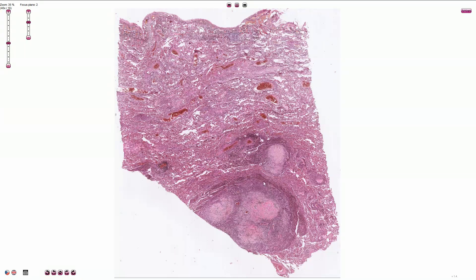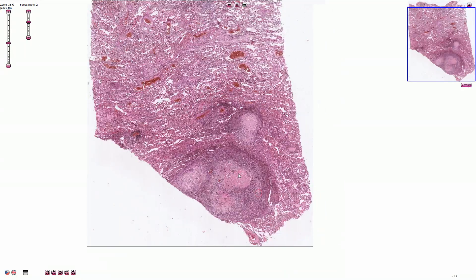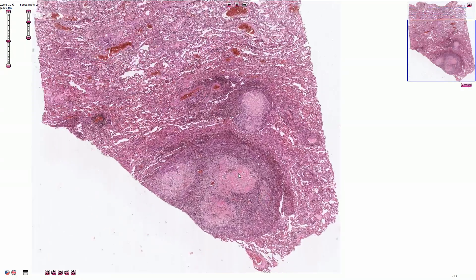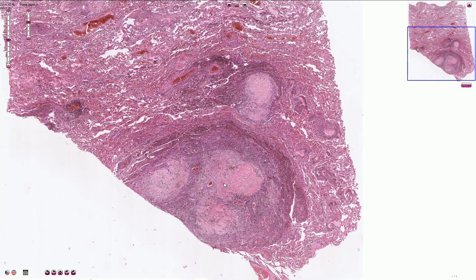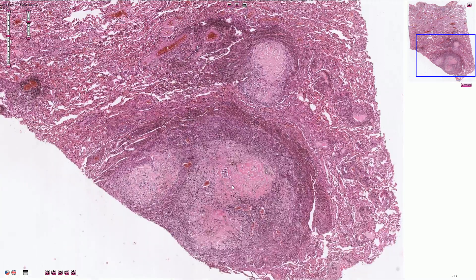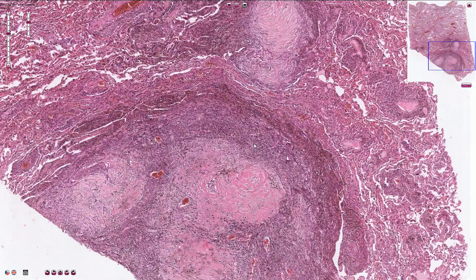Histologically, we can see quite typical silicotic nodules with concentric layers of collagen, and typically with entrapped anthracotic pigment.